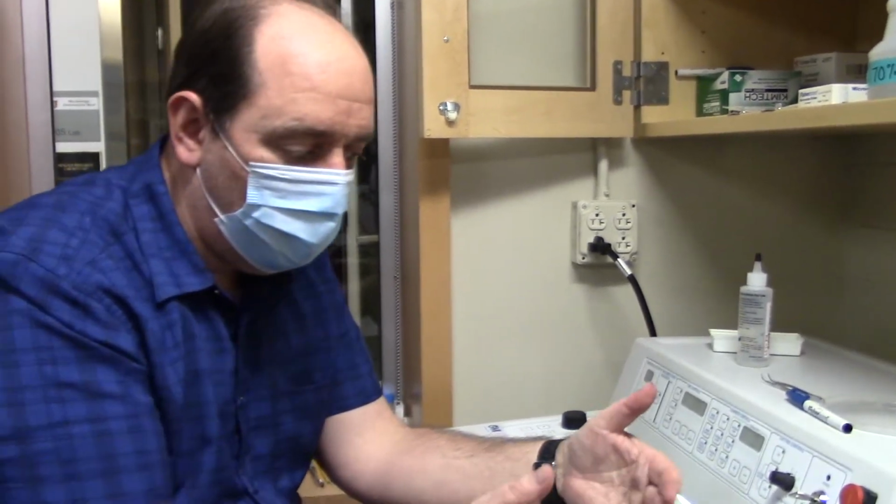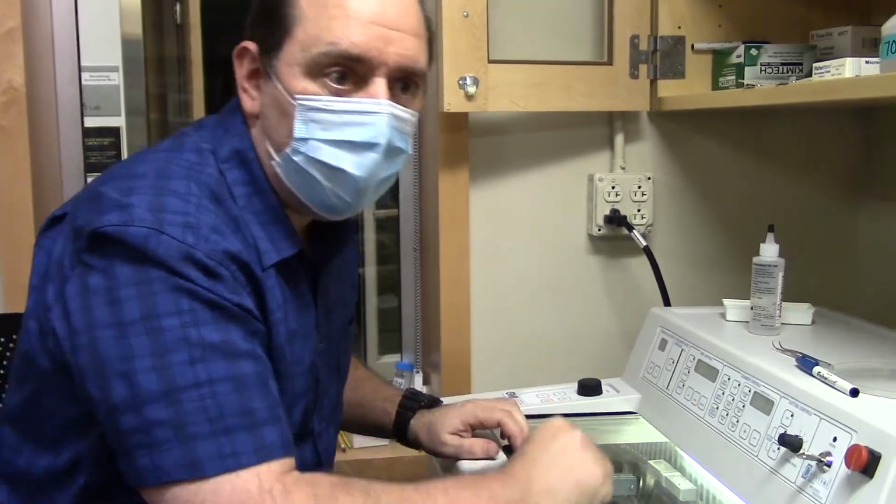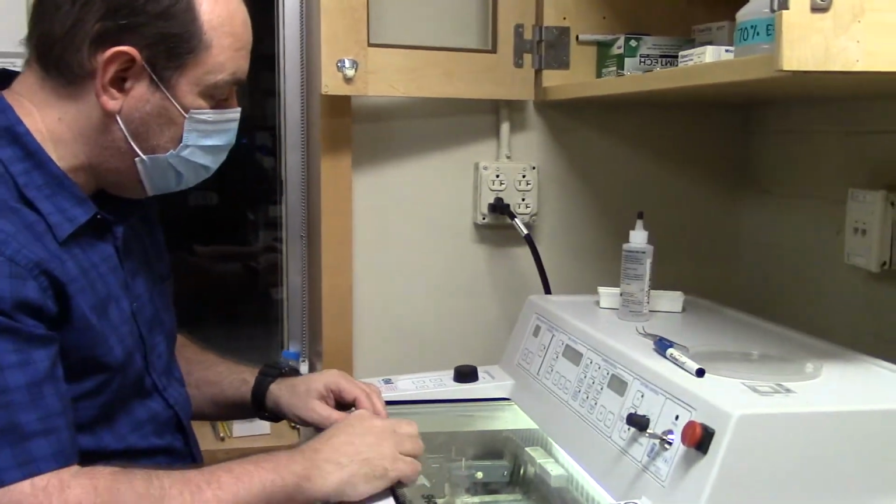And so we would label these with what we wanted, what the tissue was, so that 5 years from now, a student that wasn't even you could come and pick up these slides and say, oh, I know what's on these slides, and look at them under the microscope and see what your results were. So careful labeling of the slides is important.